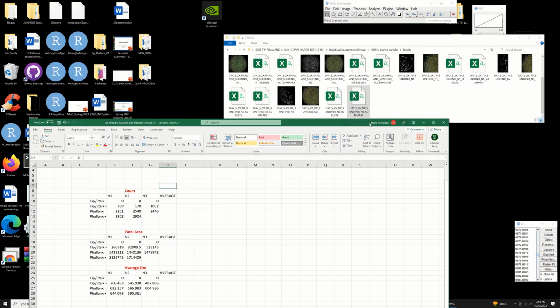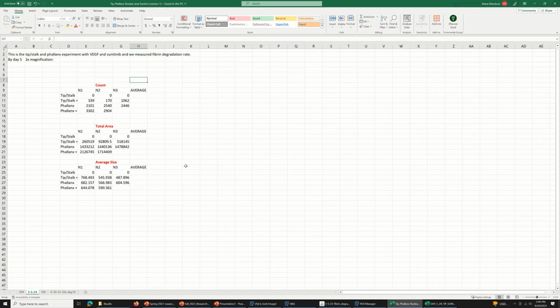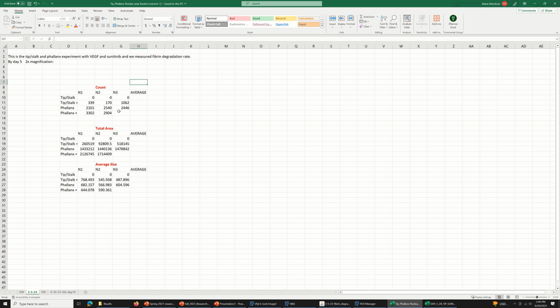Okay, so then it looks like we're done with all of our stuff here. So we have all of our numbers. This one I'm missing. Oh, this one I'm missing right here. We don't have a picture for that day, for that sample. I'm not sure why, but we're just going to go on without.